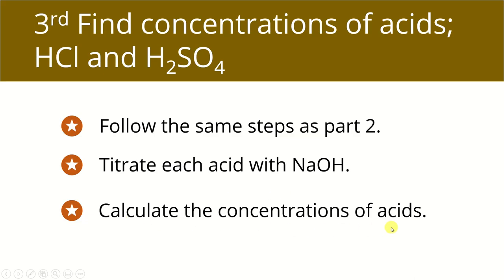So the following video is just an example of the steps for sulfuric acid. You do the same with hydrochloric acid.